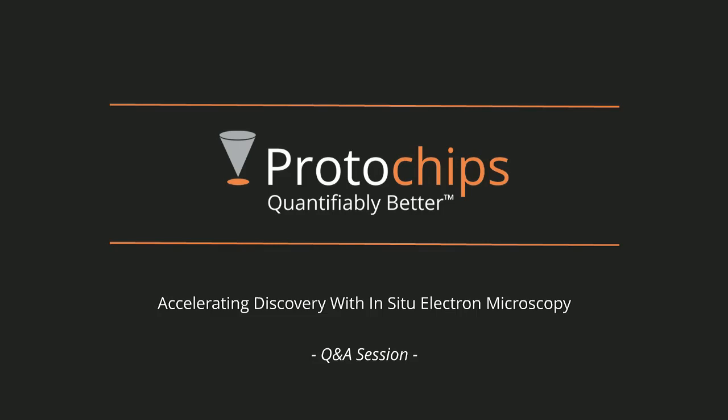Okay. Another question, are there any shared technologies to transfer 2D materials to Protochips MEMS chip? Someone says that they're having a hard time transferring their 2D material, which is graphene and molybdenum disulfide, to the heating chip. I guess that could be a great question for me.